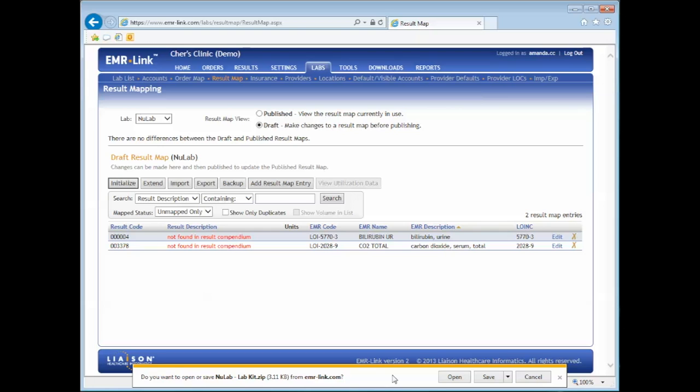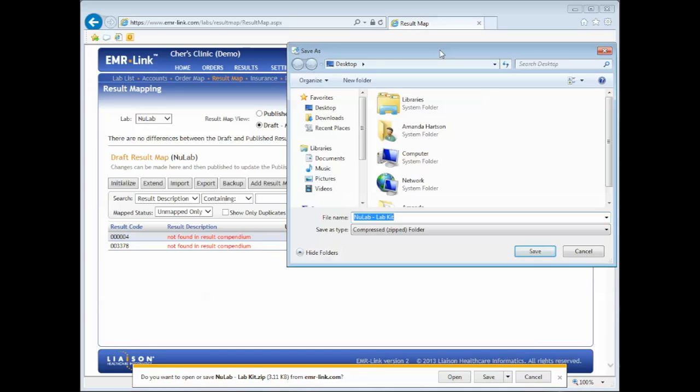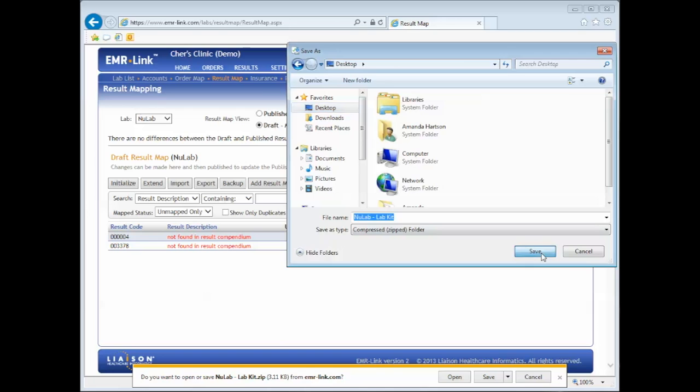Click on the drop-down to save as. Then save your new lab kit in a location where you can get to it from your DTS server. For this demonstration, I will export to my desktop.